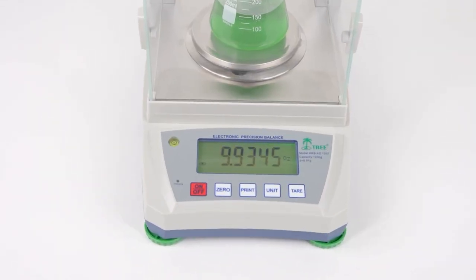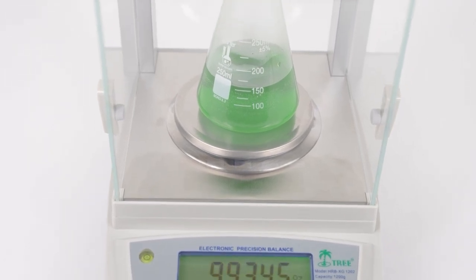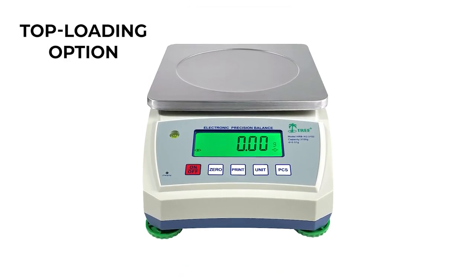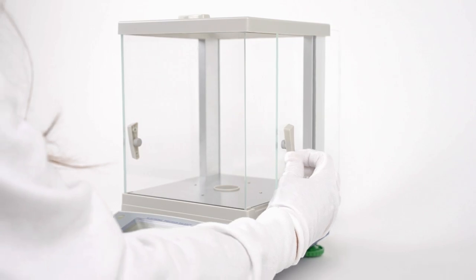The HRB-XG is available in two models, one top-loading option with a broader capacity and one with a removable glass shield.